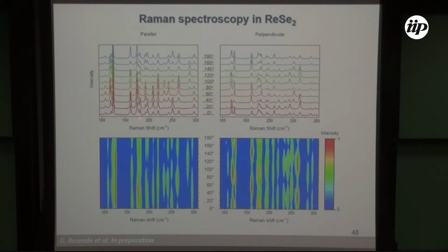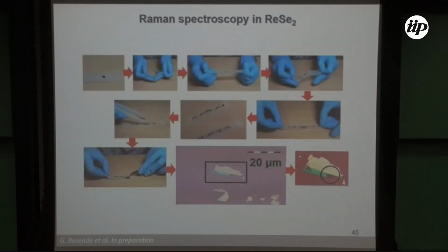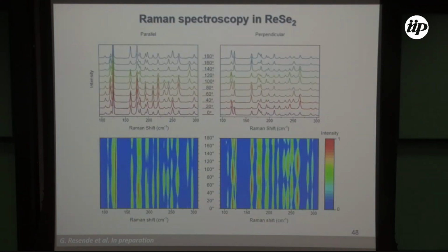Avoid that. So this is then the polarized Raman spectrum for two configurations, the parallel and perpendicular. It is important to notice that in this configuration, the incident and the outgoing polarizations are fixed. What I'm rotating is actually my sample. All right, so I have that position. A line along this edge will be the 0, and I just rotate it 360 degrees actually, but here we just show it until 180 because it just repeats itself.